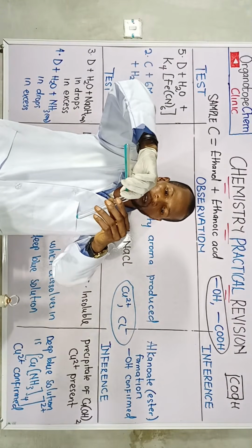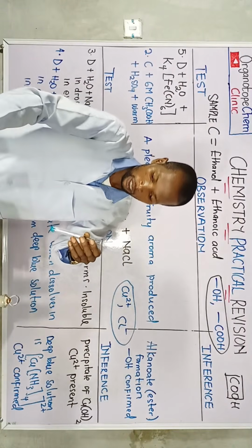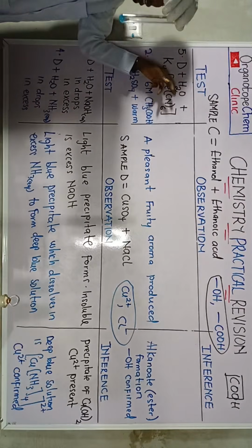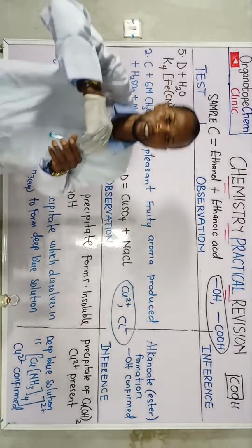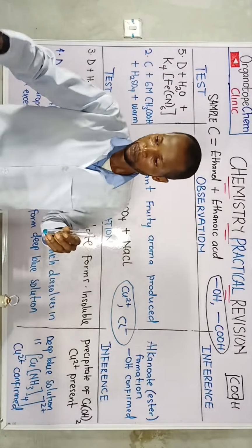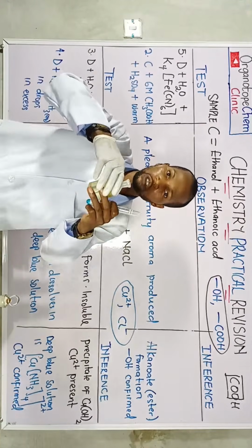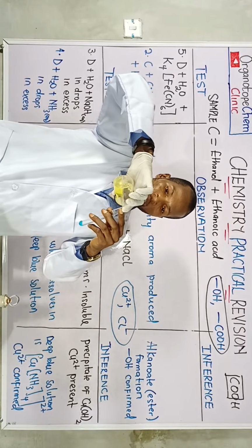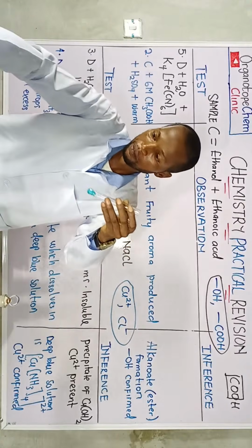So can I take the small sample? Here is the sample D, plus water. So I'm going to introduce the potassium hexacyanoferrate(II). Here is my potassium hexacyanoferrate(II). I've told you the condition of this reagent right here. So we have this. So just introduce, okay.